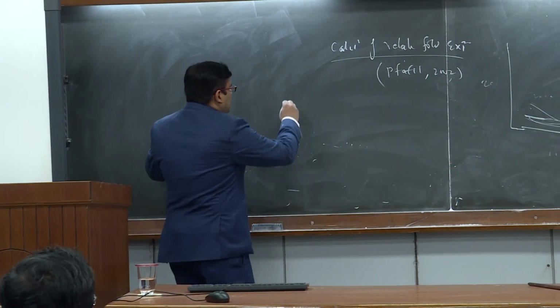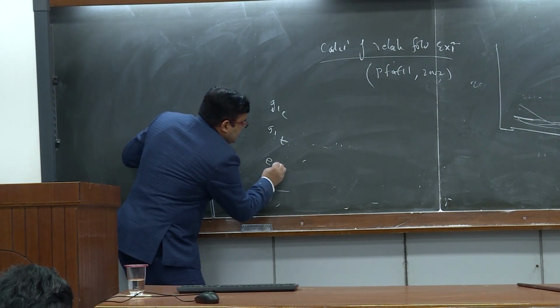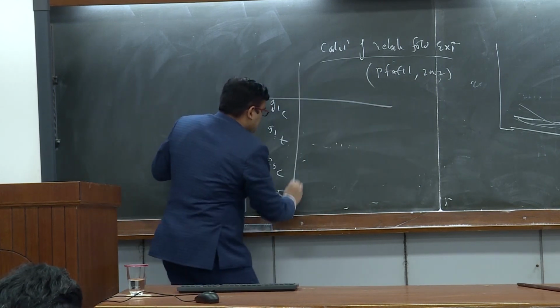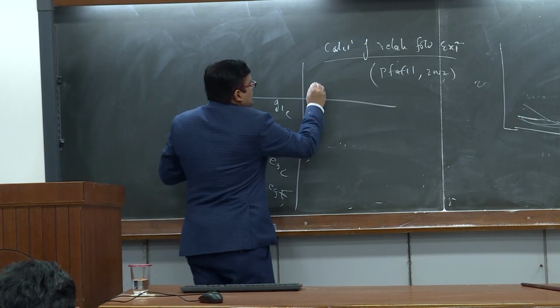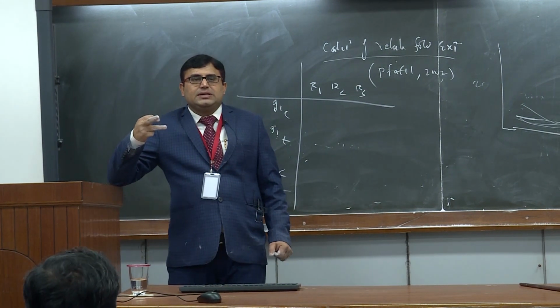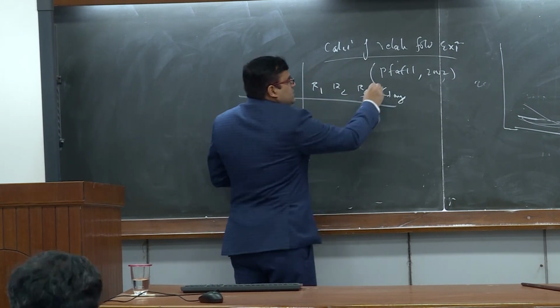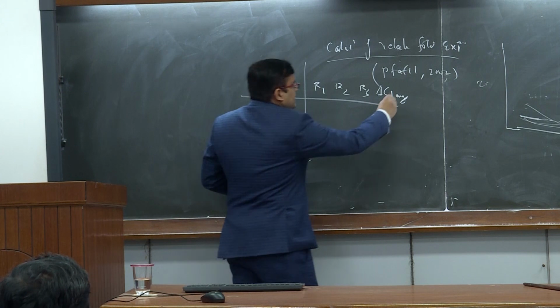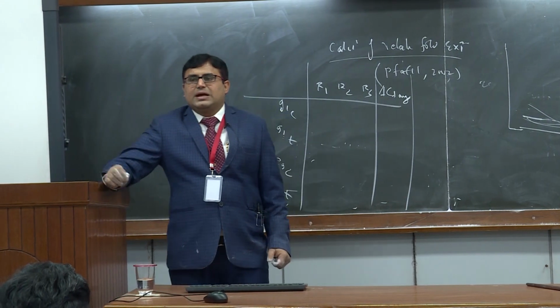Now let us take a gene 1 control, gene 1 treated, endogenous gene control, endogenous gene treated, with replicates R1, R2, R3. The first thing you have to calculate is the average value of the CT. CT average. First you have to calculate the average, and I think almost all of us know how to calculate an average.